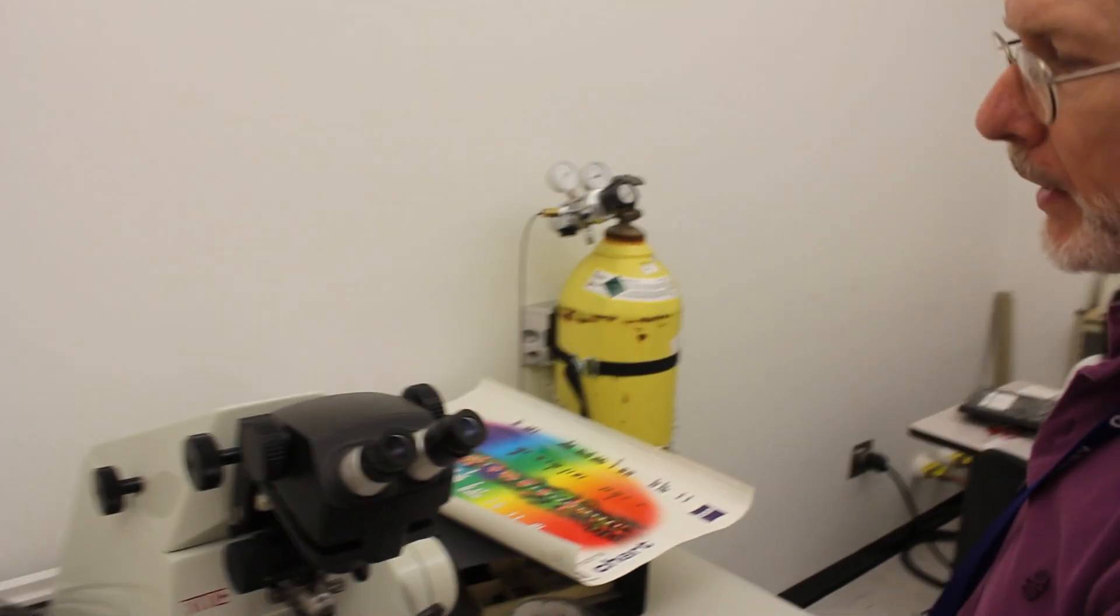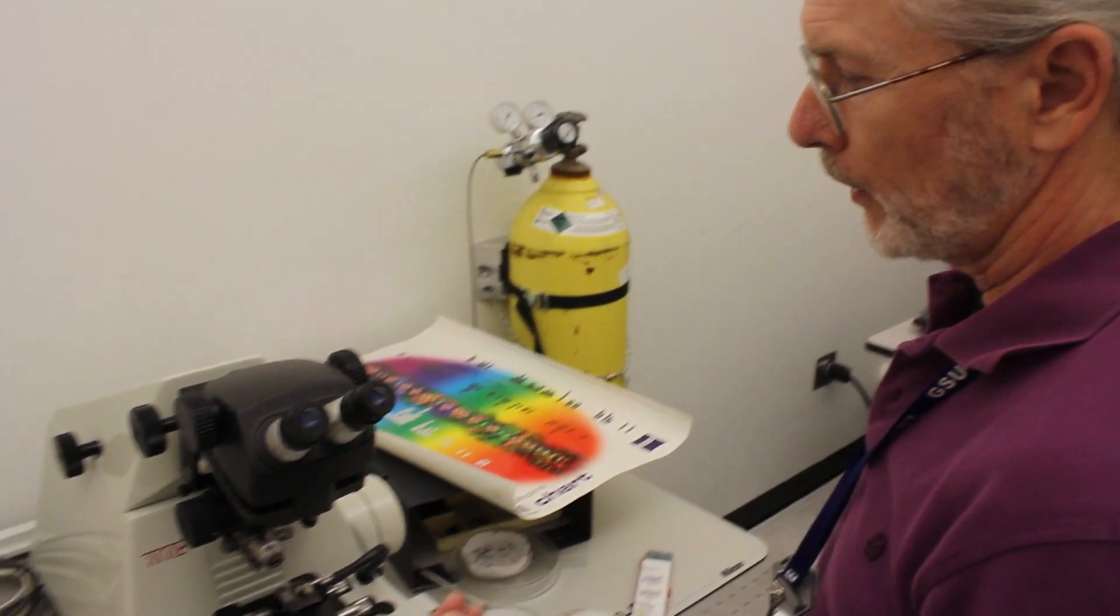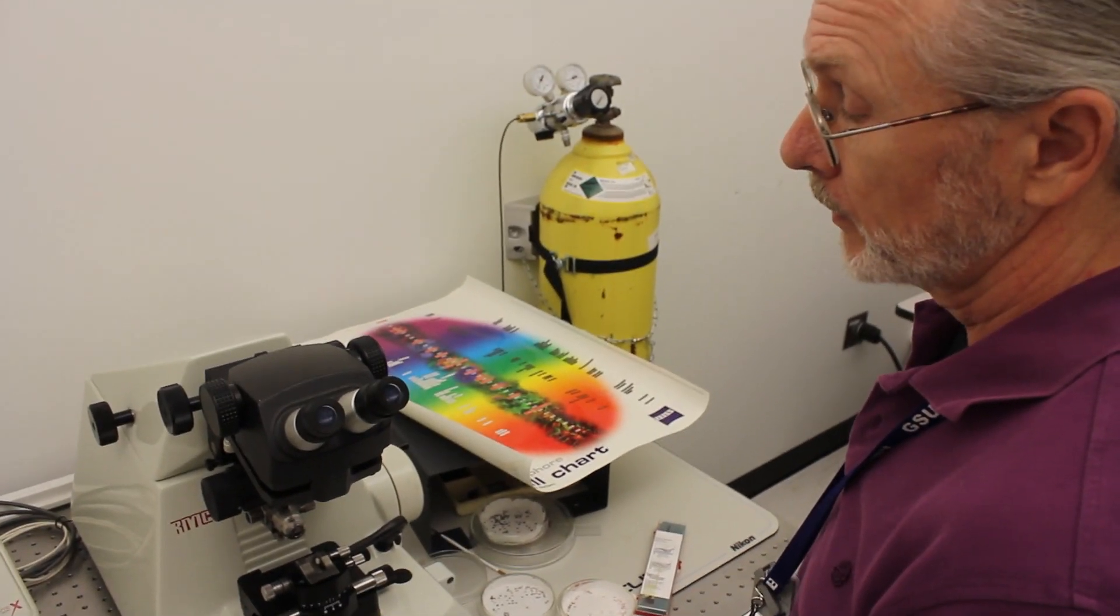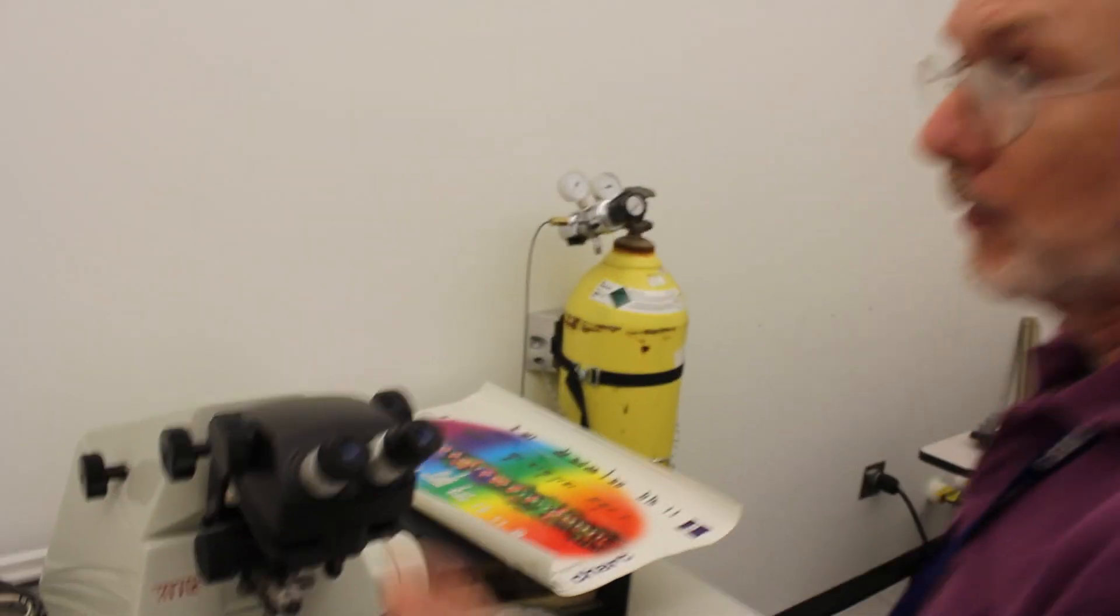A microtome, I'm sorry to back up, I'm kind of slow, but a microtome is basically like using the slice part of the cheese grater. You just take a small razor section. This is called an ultramicrotome, and a microtome basically slices the sample.